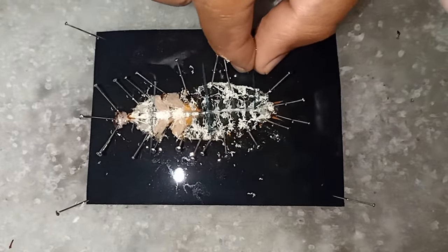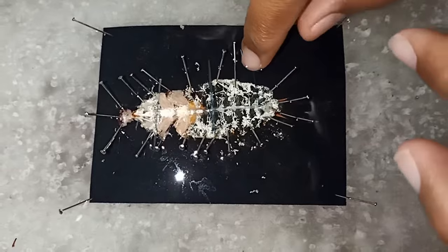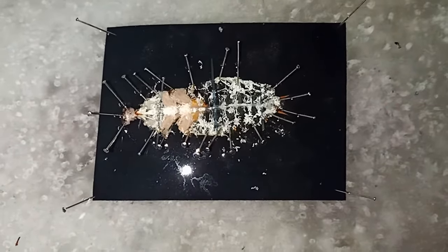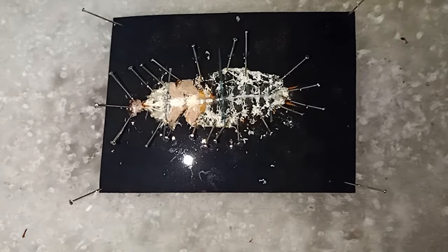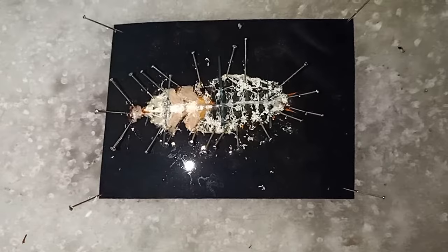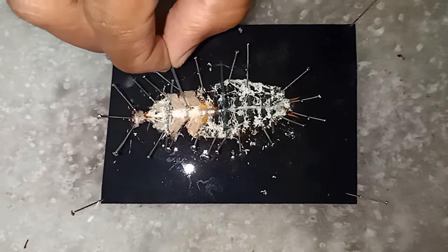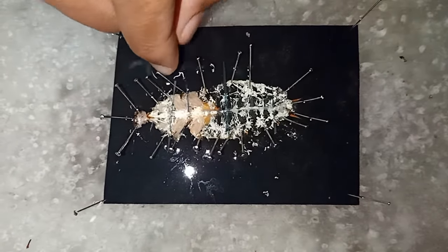The sympathetic nervous system consists of some ganglions and their connectors. There are totally 9 ganglions present in the cockroach. 3 ganglions are present in the thoracic region and 6 ganglions are present in the abdominal region. In this dissection, we are exposing every ganglion present in the thoracic and the abdominal region.